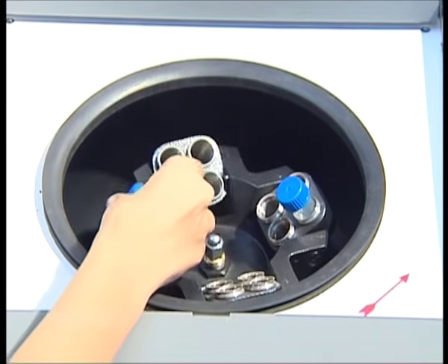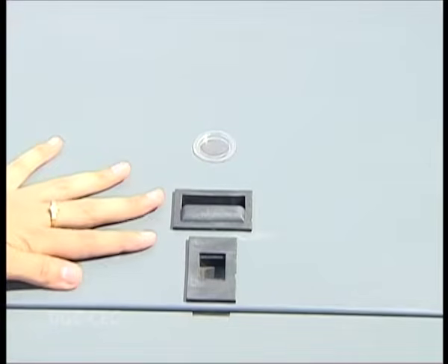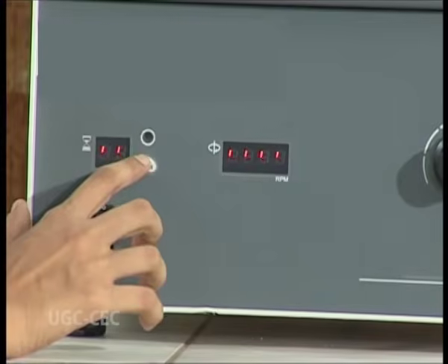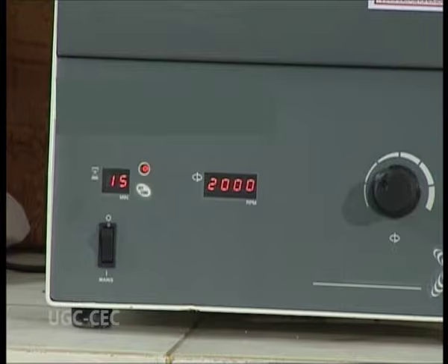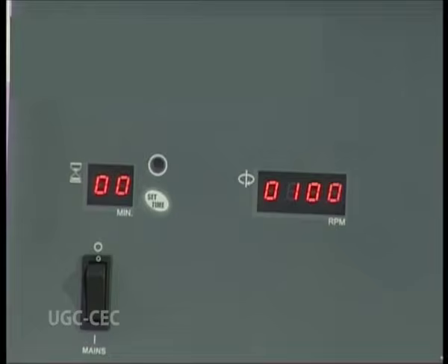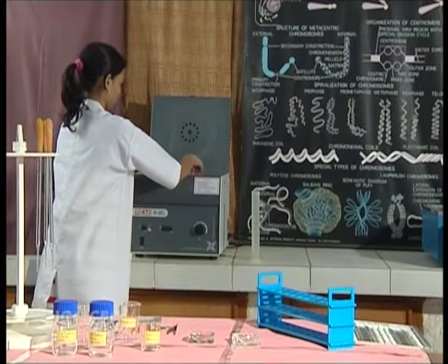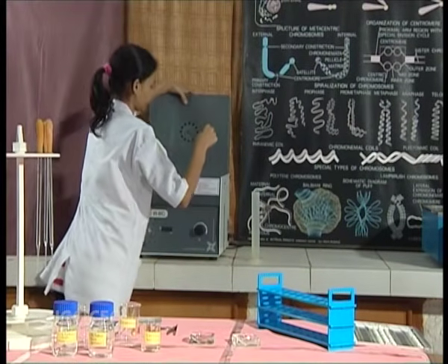If required, take a balancing tube. The tubes are centrifuged at 2000 rpm for 15 minutes at room temperature. After centrifugation, the cells settle down as pellet.